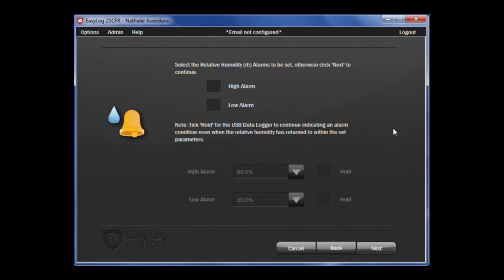If it is a humidity logger, you can do the same for the relative humidity page, but I am going to leave these for the time being. If you are using one of the thermistor probe loggers, there are options for the probe type as well. You just need to make sure that the selection matches the probe type you have.